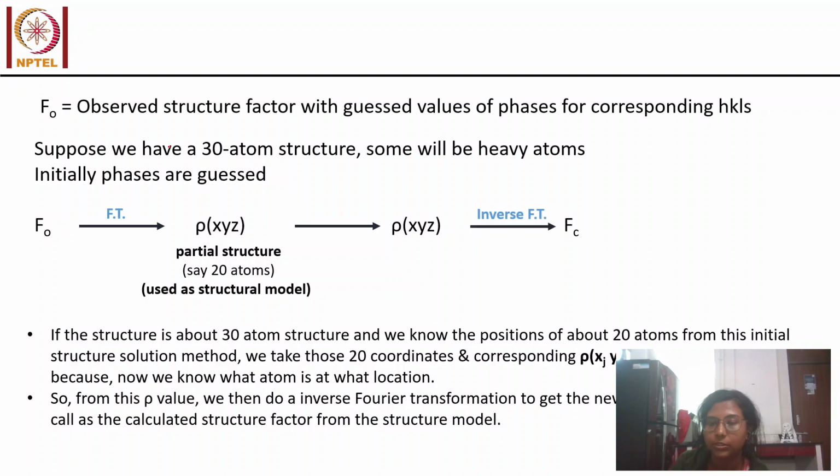We took the manganese nitrate salt, and then we took some organic ligand, like ethylene diamine or something. That is quite big. And then when we get the crystals, there will be a large number of atoms in that crystal.